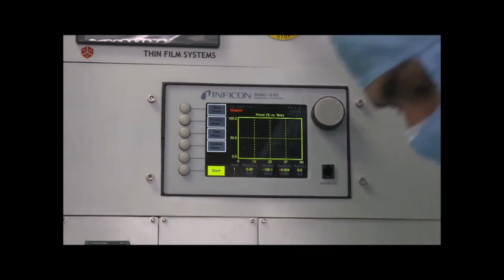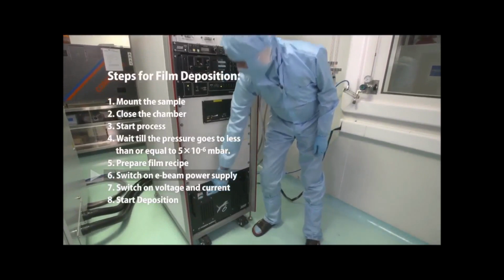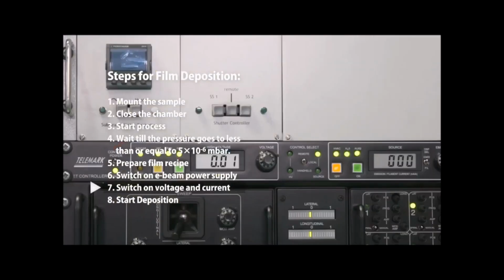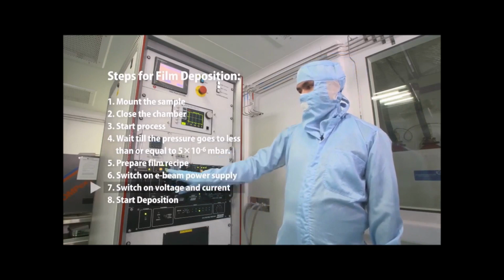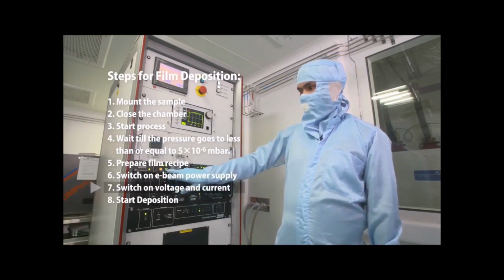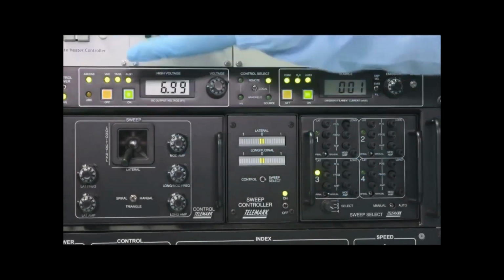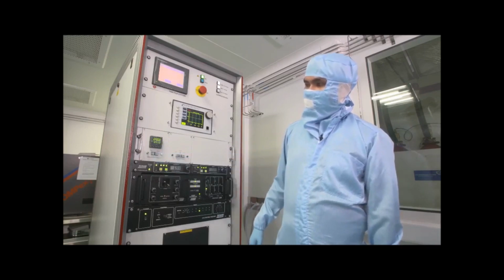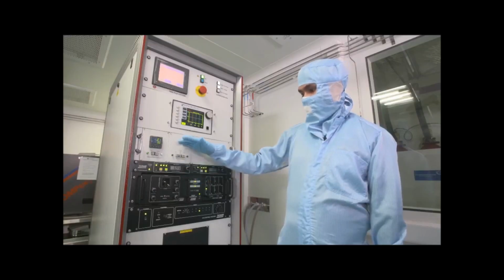To switch on the E-beam gun, we have to first switch on the electric power supply here, and then we have to switch on the control power, and it is blinking, so we have to wait 3 minutes until it becomes stable. Now the LED is stable, so we can switch on the voltage source and the current source. First switch on the voltage source and then the current source. We can see the chamber temperature here. Right now it is 21 degrees Celsius.